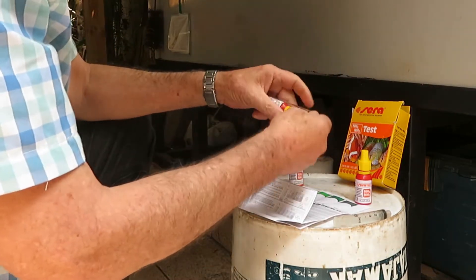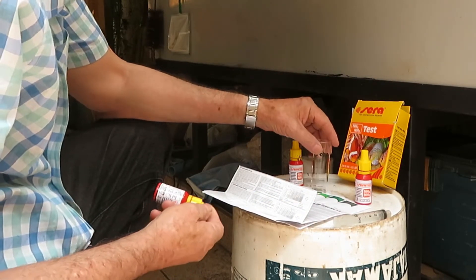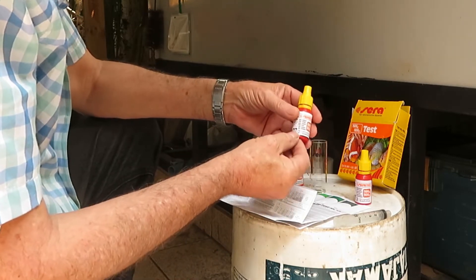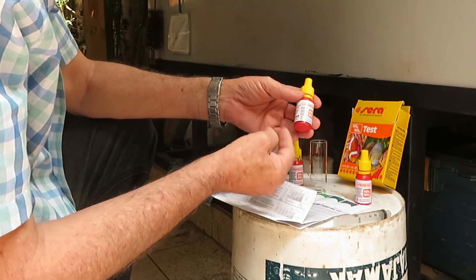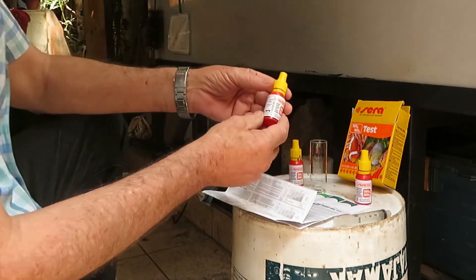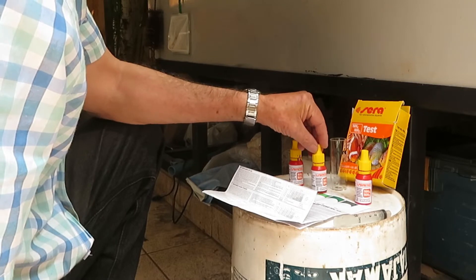One of the reagents comes inside a flask which will be used to do the test, probably because this is a very dangerous reagent. It contains bleach and sodium hydroxide, or lye, which are corrosive products and a hazard for people and animals.